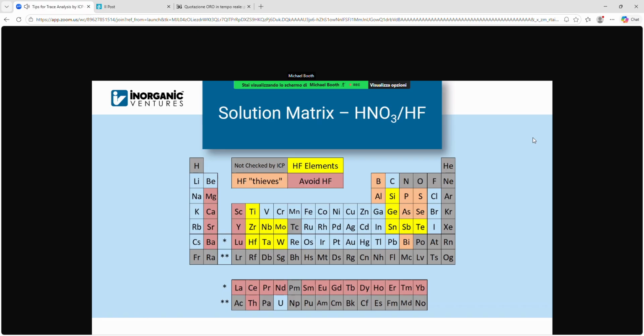So to get around that, you have to spike in extra hydrofluoric acid to account for the HF that's going to be taken away from the ones that really require it. So this is where it starts to get a little bit more complicated. This is why you may have limited stability when you're starting to mix different pre-made stable blends of solutions together.